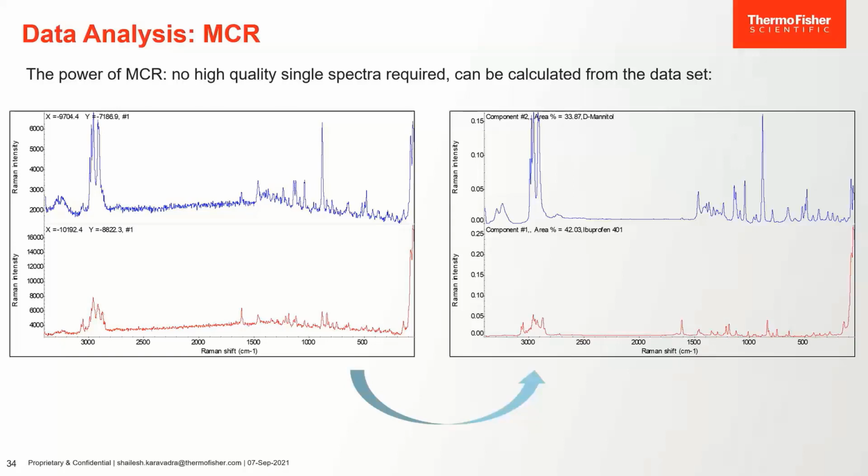Generally, MCR has the ability to estimate both simultaneously from a spectrum. The specific feature of MCR is the decomposition of a spectrum in a physically or chemically meaningful way.